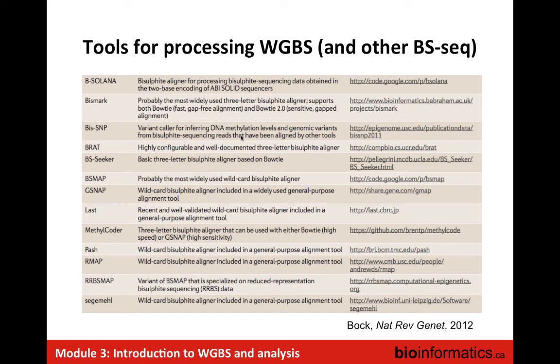So tools, and this is now closer to some of the tools that we're going to be covering in the practical. Some of the tools for processing whole genome bisulfite sequencing, I've listed them here. In the next few slides, once we actually go into the pipeline, I'll explain in more detail some of the differences, because there's really a different philosophy of how you process these bisulfite sequencing reads. Really, the challenge is that, if you remember, we've changed some of the DNA bases in the read such that the mapping step is going to be a bit of a mess, because they no longer necessarily map to the reference directly.